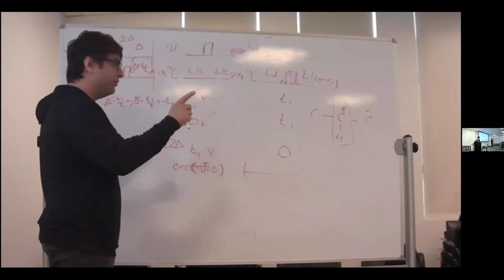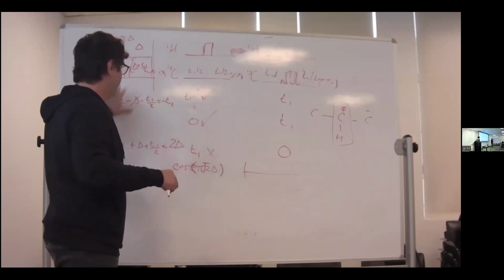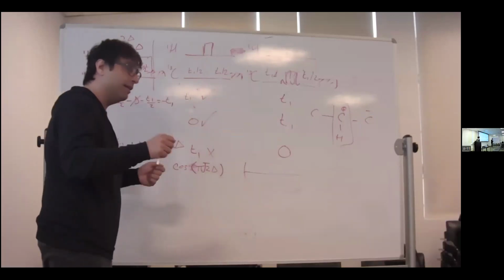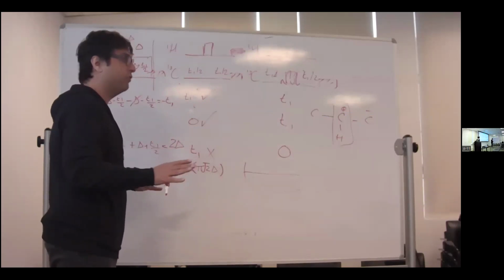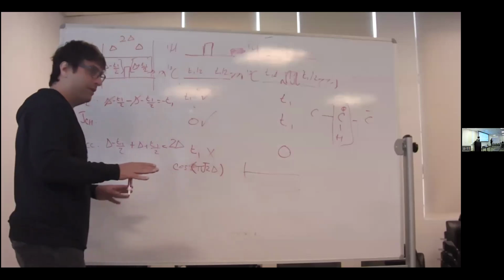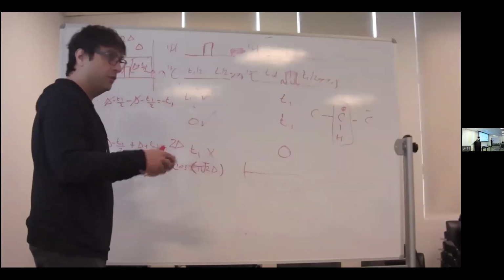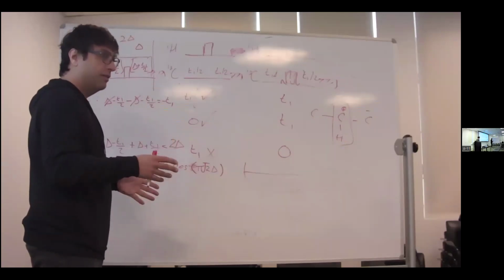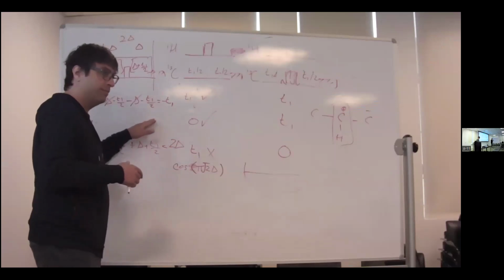And then you grow the signal, and now it's getting burdened by relaxation. Here, even the first point when T1 is 0, even though I'm refocusing everything, the magnetization is evolving for the period 2 delta, so you get a big hit on signal. It's not for free. Nothing is for free, right? But if you have a sample that's reasonably concentrated and you have the luxury of losing a little bit of signal, you can avoid losing signal from J coupling evolution.